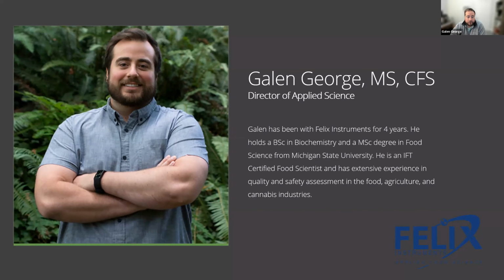So if you have bad data in your model, you're never going to have a really well-performing model. It'll be a bad model. Really, it's all about having high-quality data going into the model building process. The stage that we're going to talk about today is just a little bit of the icing on the cake. It does have an impact, but it's not nearly as significant as the quality of the data in the model. So that is definitely the more important step.